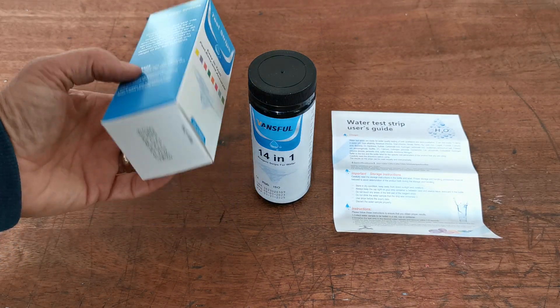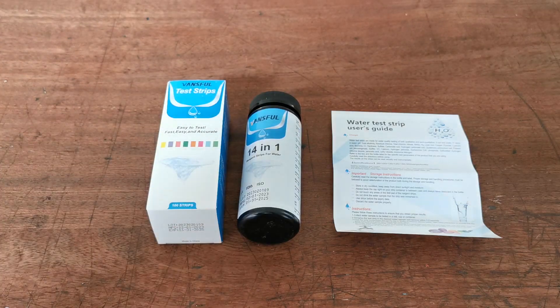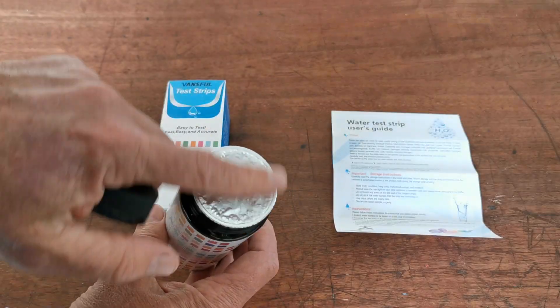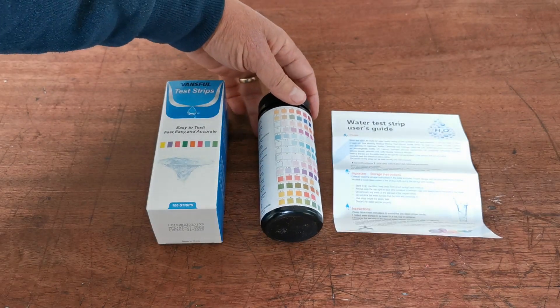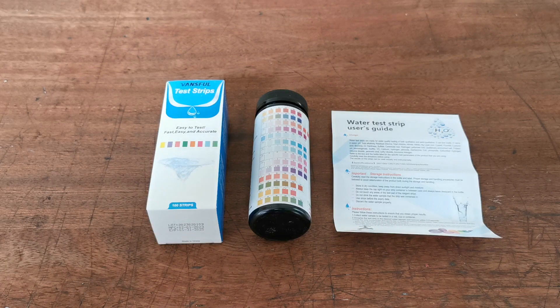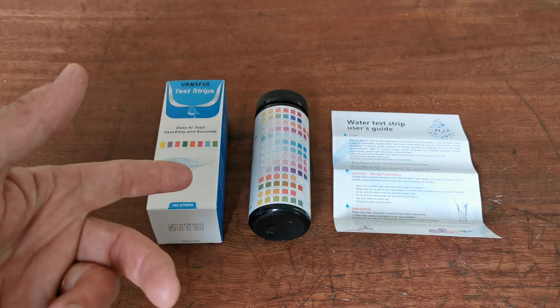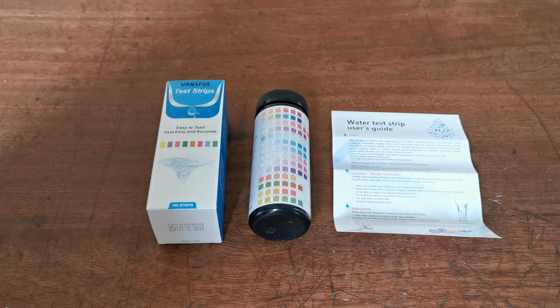This pack comes with a really nice water test strip user's guide, in the original manufacturer's box packaging with all expiry dates as you would expect. When you first open the pack, there's a seal inside. Once you break that seal, moisture can start to enter the test pads, and over time this will cause them to deteriorate. The manufacturer recommends using the test strips within three months of the seal being first broken, but there is a little pouch of desiccant moisture-absorbing chemicals inside.